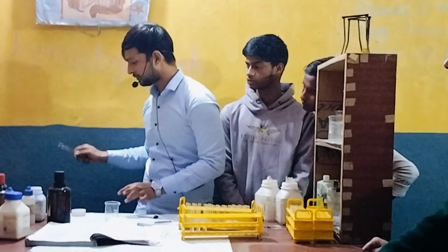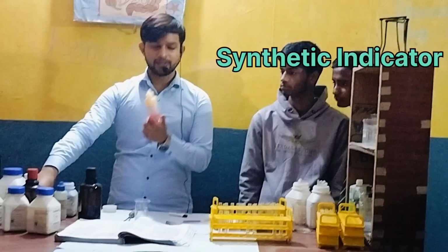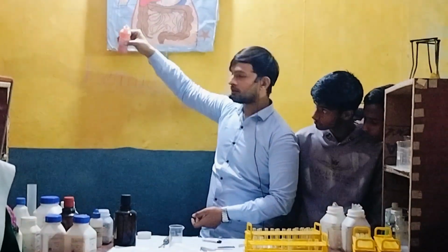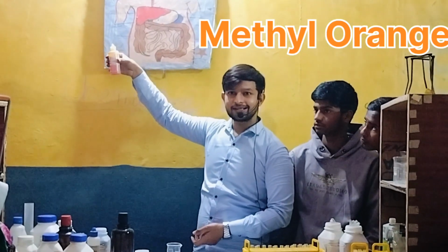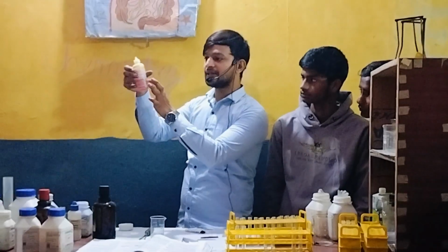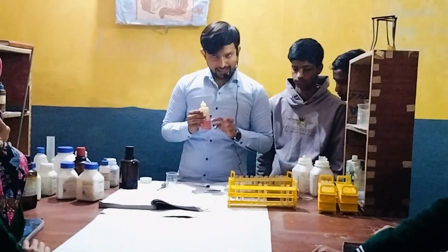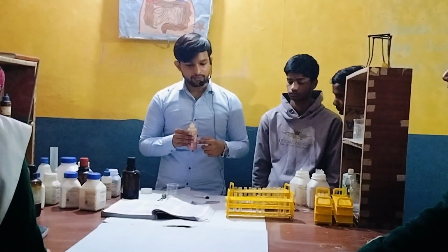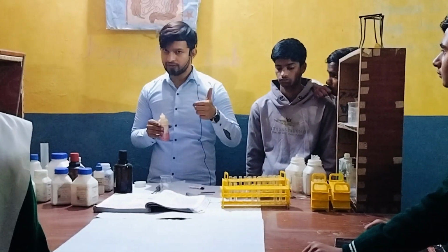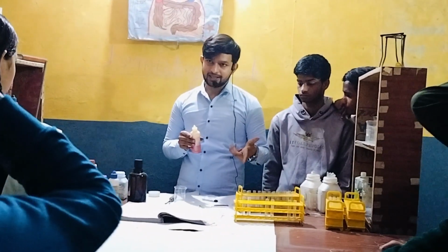Fine. Please stop. So this is methyl orange. Okay. Please see the color. Blood red color. Orange basically. Okay. Methyl orange. This chemical is methyl orange. Fine. Now we will add few droplets of methyl orange in acid and then it will change into red color. Fine. And after that we will put few droplets in base and the color will change.